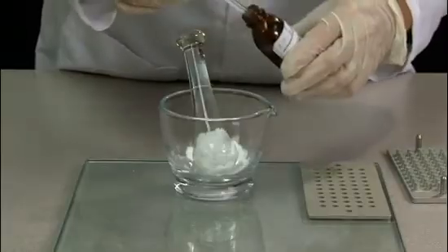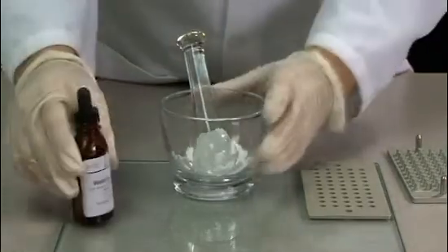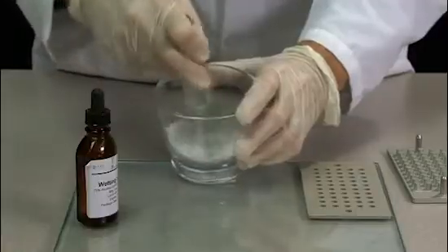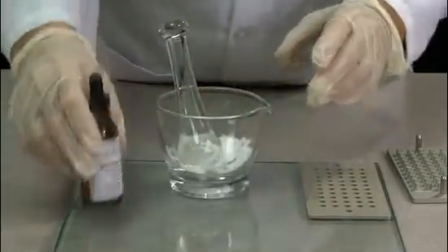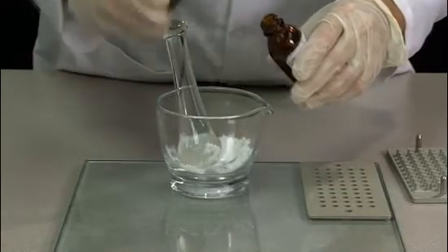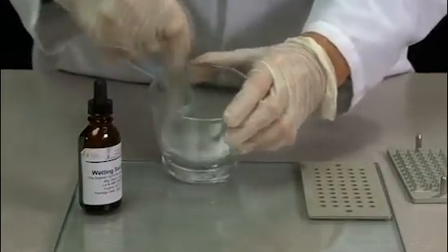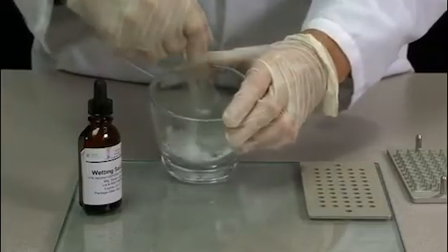So that we do not add too much of the wetting solution at a time, add only 3 or 4 drops and triturate lightly. Continue that process until one moment in time when the powder adheres to the pestle.